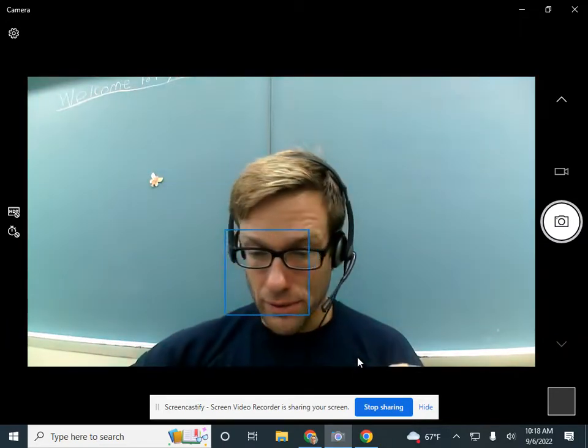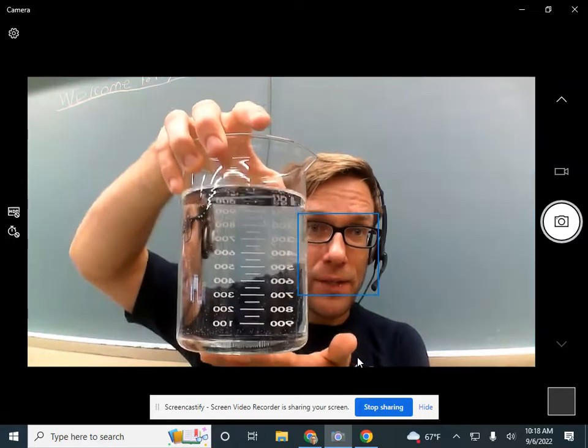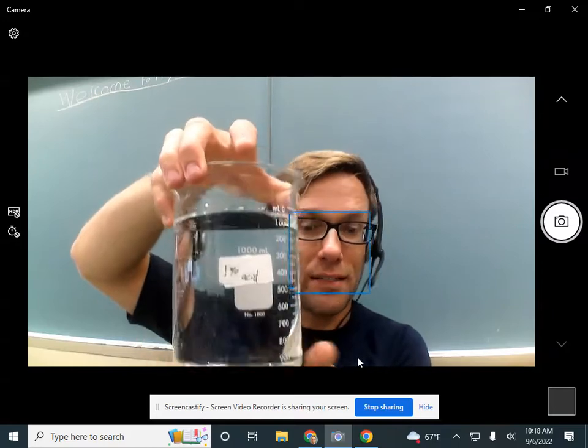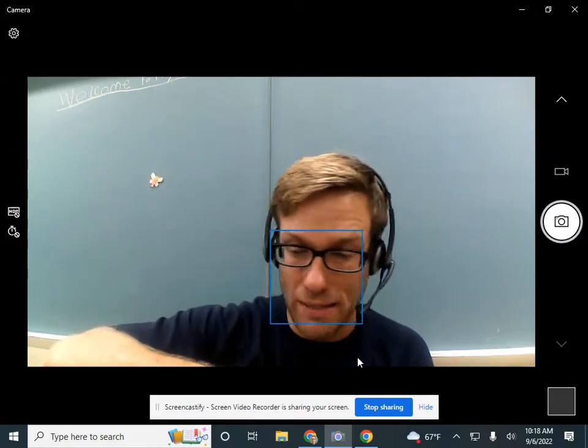The acid we're going to be using is in this beaker. And what it is, is vinegar diluted down to different concentrations. I have the 1% here as my example. So one of the groups has that.